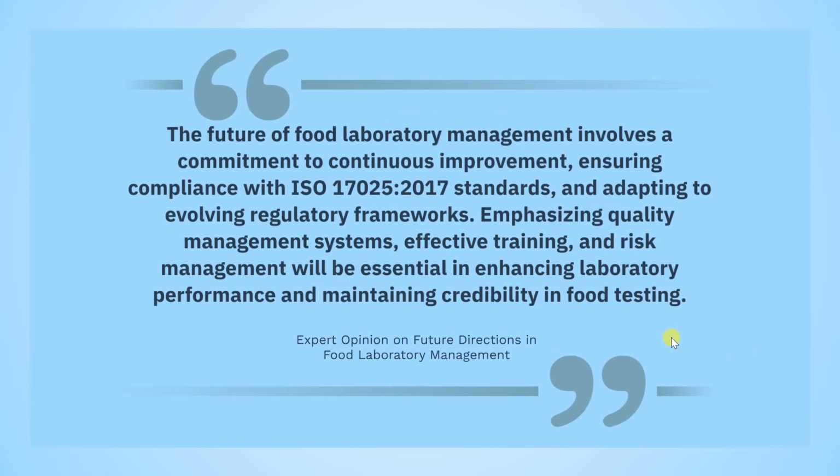Now, the future of food laboratory management involves commitment to continuous improvement, ensuring compliance with the ISO 17025 standard, and adapting to evolving regulatory frameworks. Emphasizing quality management systems, effective training, and risk management will be essential in enhancing laboratory performance and maintaining credibility in food testing. This was said by an expert in future directions in food laboratory management.